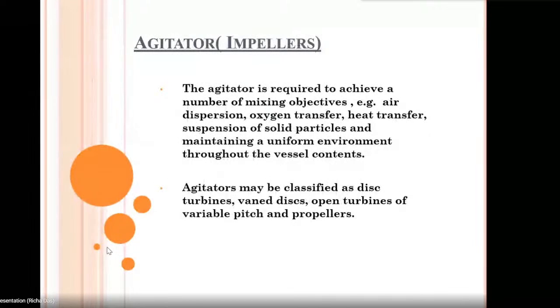The next part is the agitator or the impeller. Let us start like this, with the same example. In our homes, we have used mixers. Inside those mixers, we have seen there are some blades present. What are those blades or fan-like structures, and what is their significance? Whatever content we inoculate inside the mixer, these blades are going to break those contents.